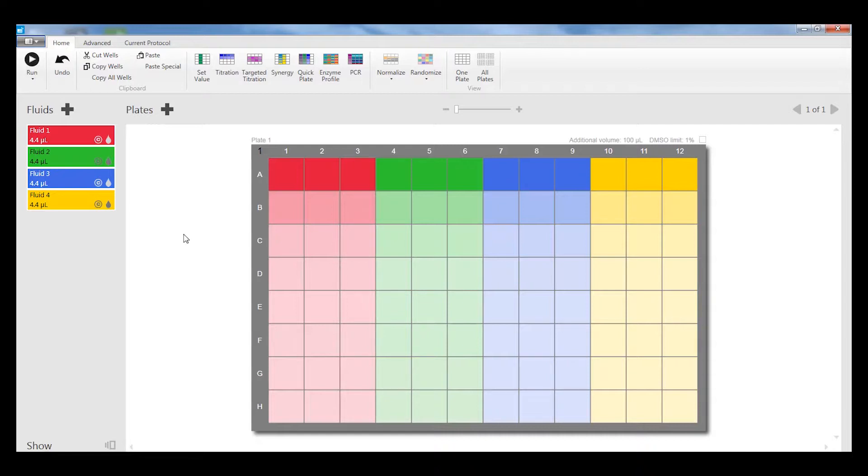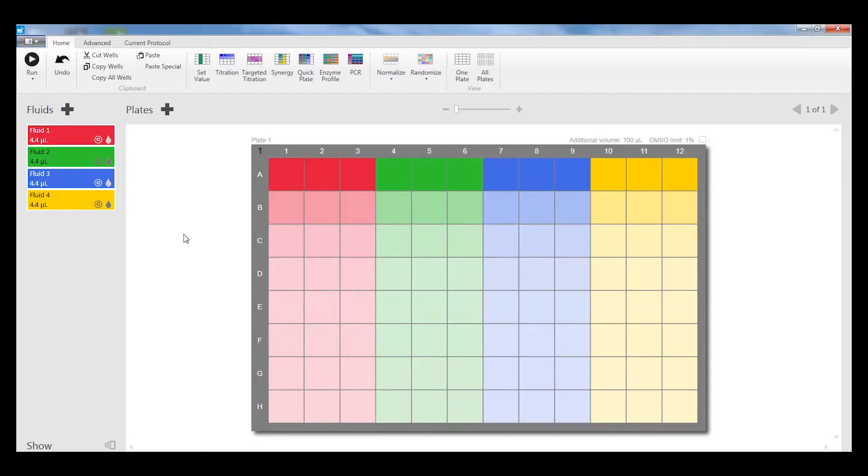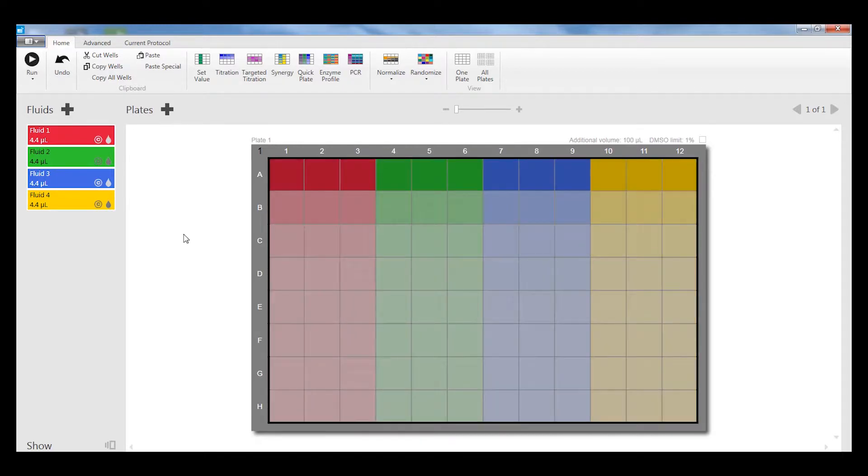You may want to have the same amount of DMSO in every well, in which case you would use the normalization function of the software. First thing to do is to select the wells that you want normalized. I can do Ctrl-A to select all the wells in the plate.